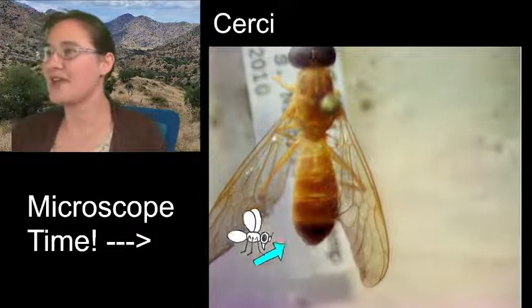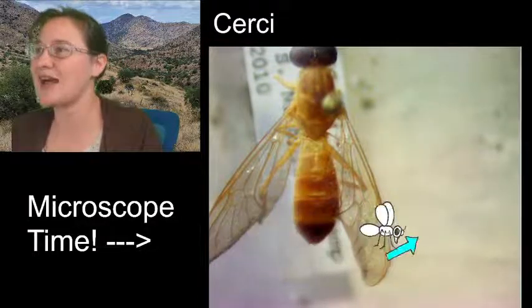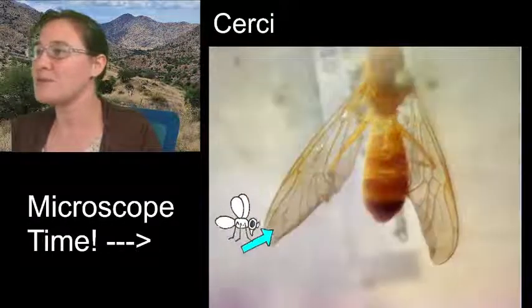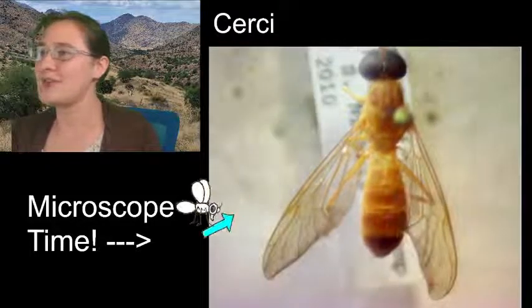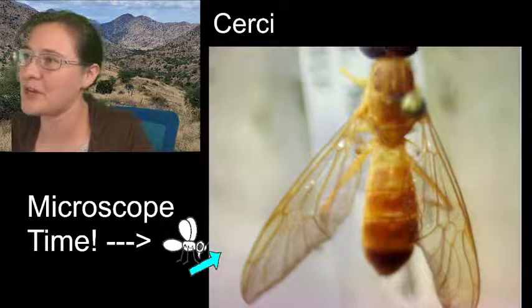Now, here's the thing. I want my wing to be pointed out more like this one and less like this one, because my sketch ends at the end of the abdomen, so I don't need my wing to be going so far back. So I'm going to be using this wing, and I might even be pointing it out even more so that I can try and get as much of the wing on my paper as possible.